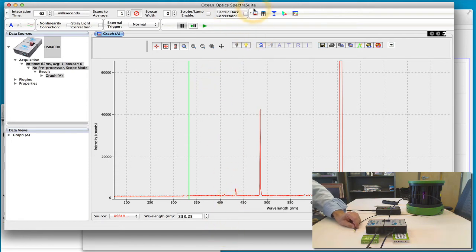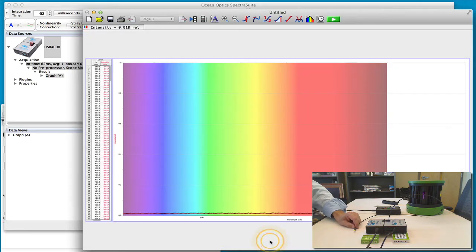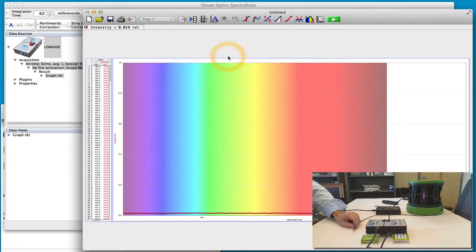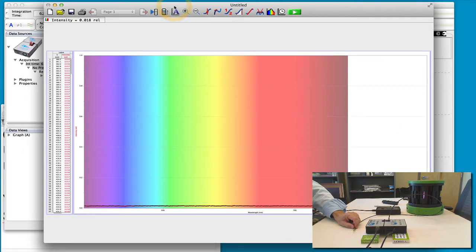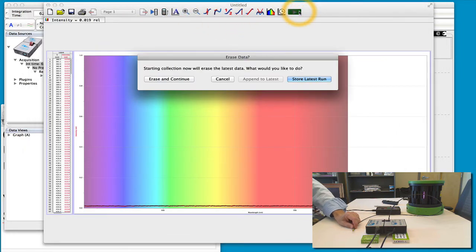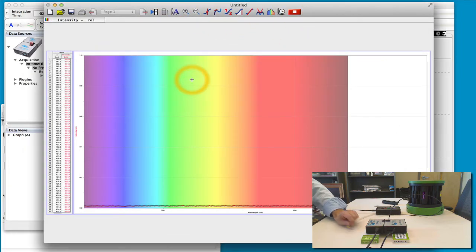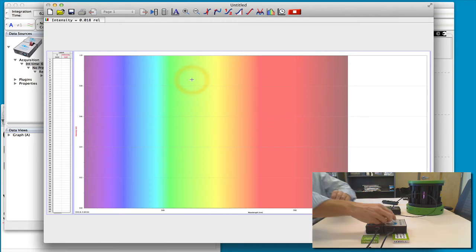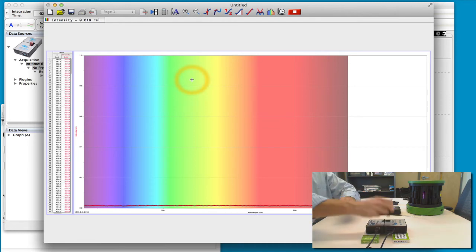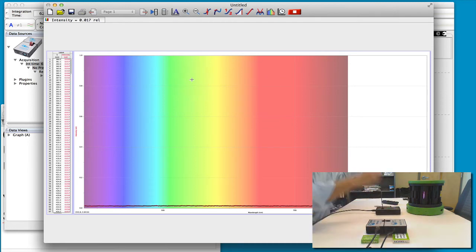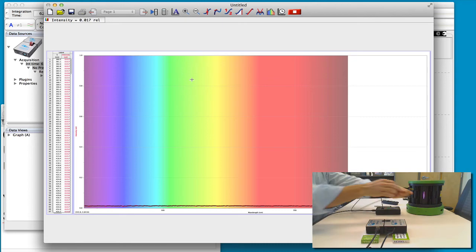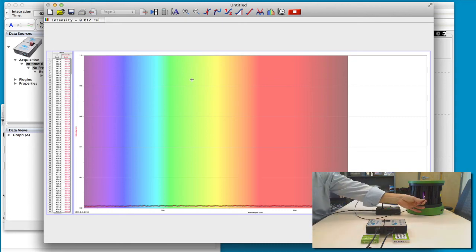So Ocean Optics uses Spectra Suite as their software to collect. Vernier uses Logger Pro and that's the software right here. And so again I can start it and now put this spectra into this spectrometer here, hold it up to the emission line.